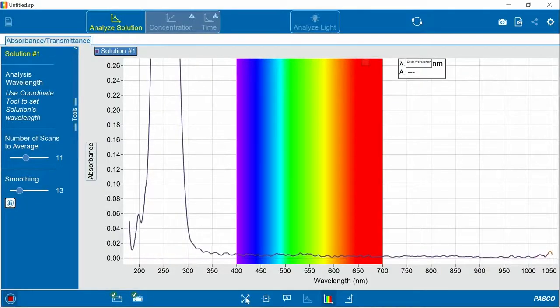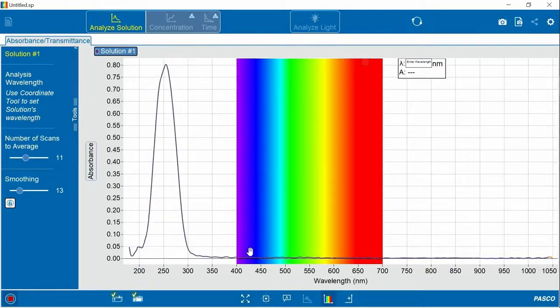I'm going to scale the data. And you'll notice that this solution does not absorb light in the visible region, but it does in the UV region. Now I can use the coordinate tool to identify the peak absorbance. And you'll want to keep your maximum absorbance below 1.